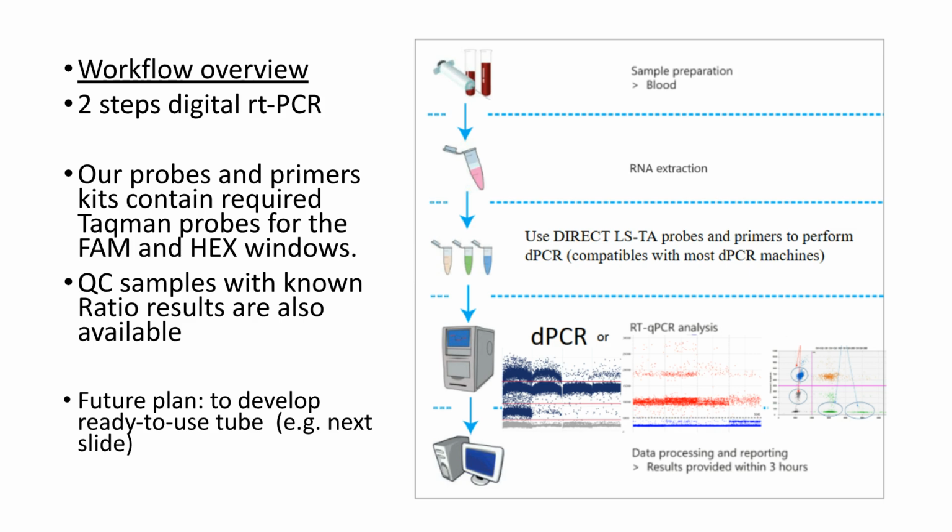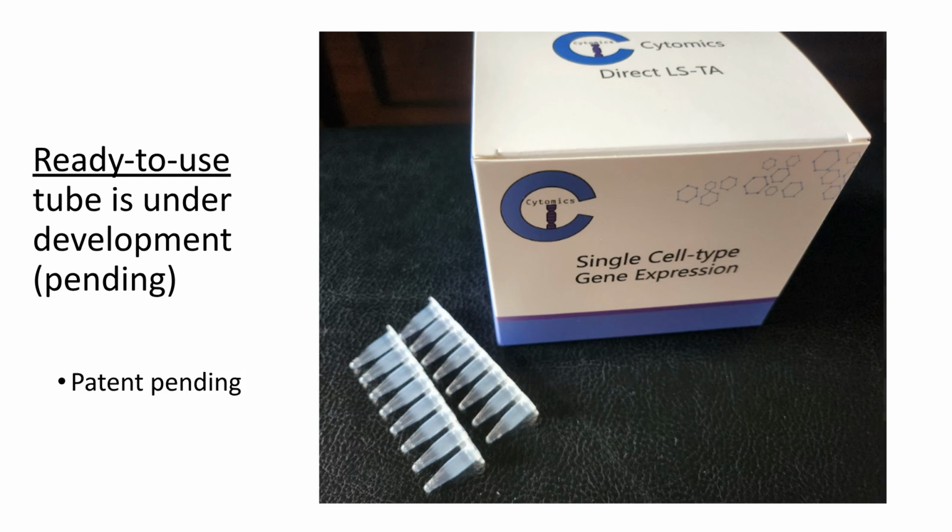We also have plans to develop a ready-to-use tube. A ready-to-use tube system for this assay is currently under development, with a patent pending.